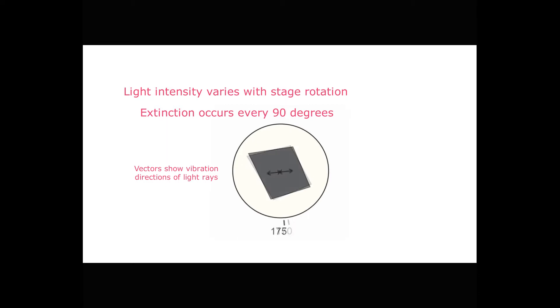As we rotate the stage slowly, more and more light will get through. And the maximum amount of light will be when the angle is at 45 degrees to extinction.